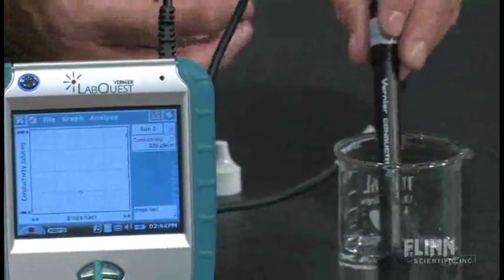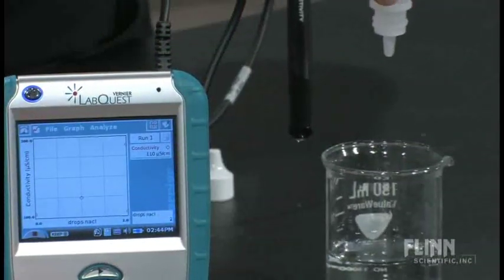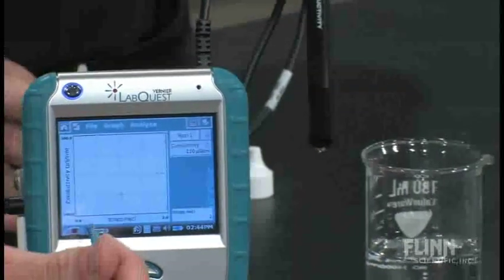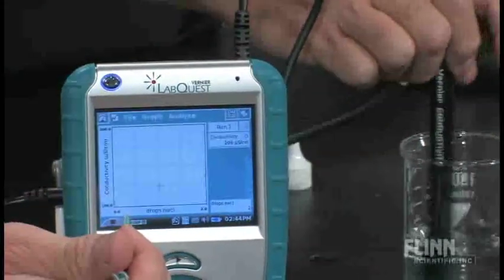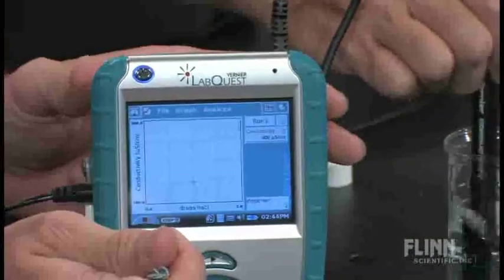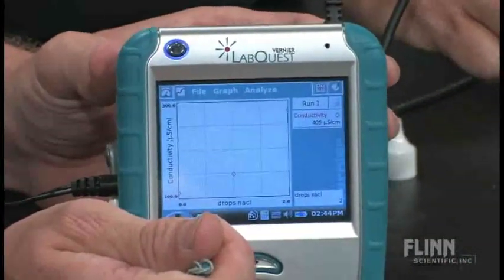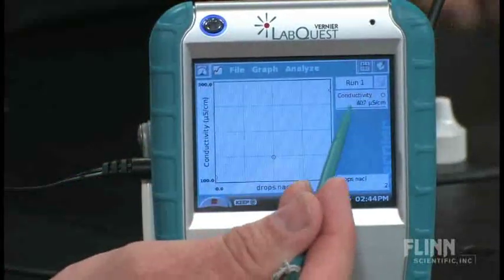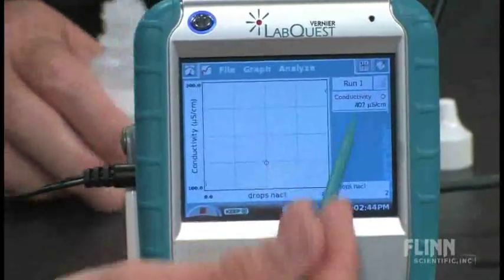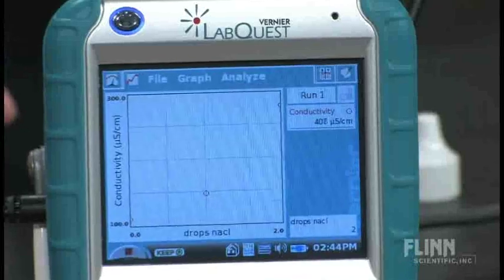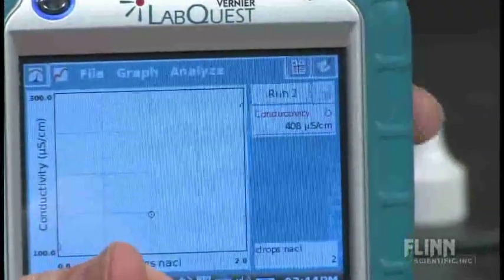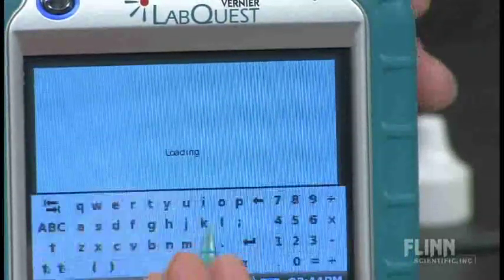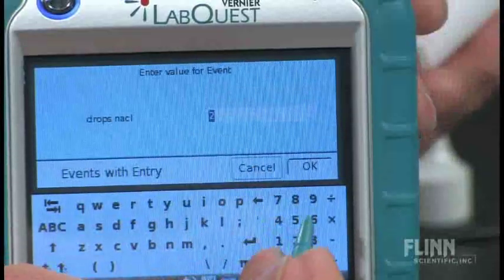And let's put a third drop in. And swirl. And I will keep that. I can see up here in the upper right corner, I can see the meter running. So I can wait until that settles and hit keep. And that's my third drop. We're going to do one more drop after this.